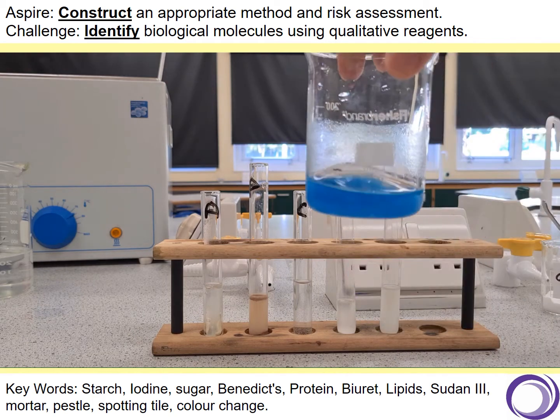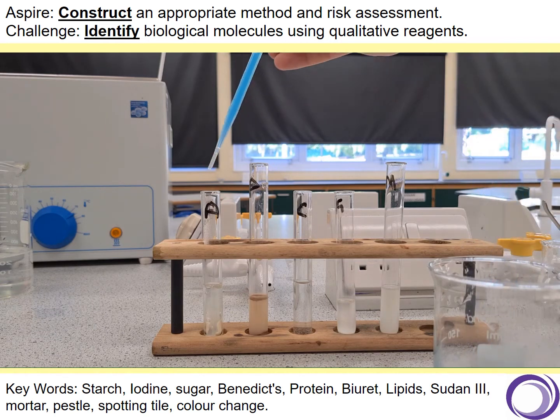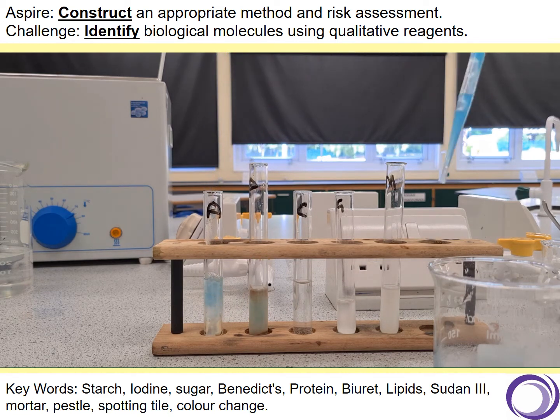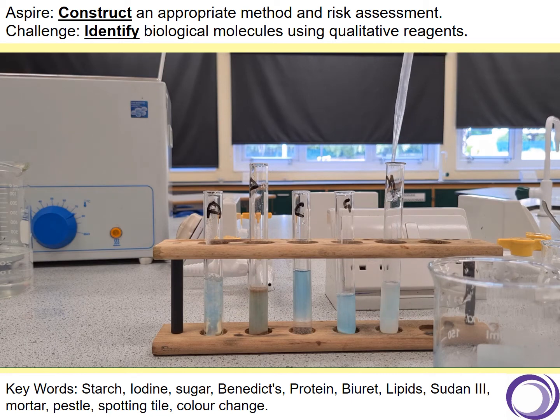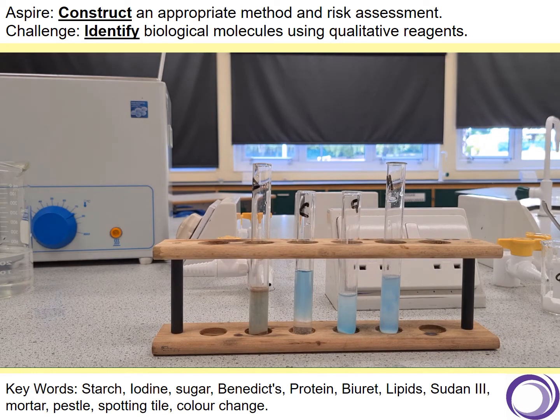Okay, so notice it is now blue. And what we're going to do is add a couple of drops of Biuret to each one, so it goes a blue colour so I can see it. A little bit more in this one. And into this one. And then I need to give each one a good shake. Okay, so I'm just going to shake these really well. Put a bung on top of it, just give it a quick shake, and then leave it to settle.